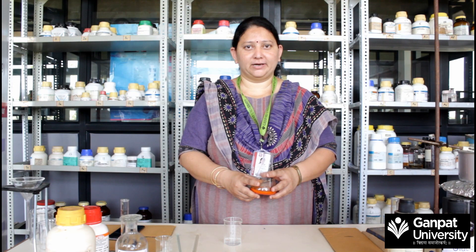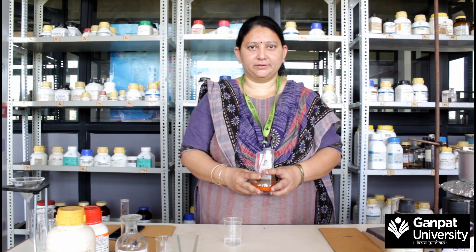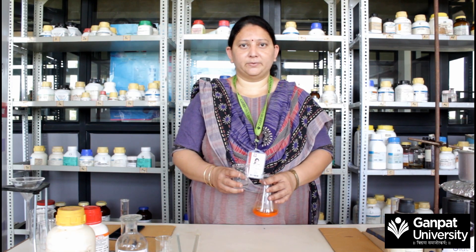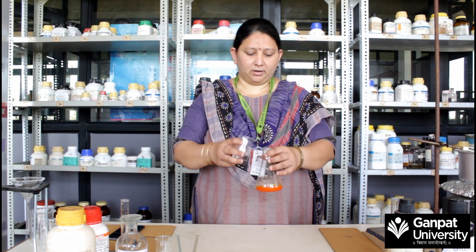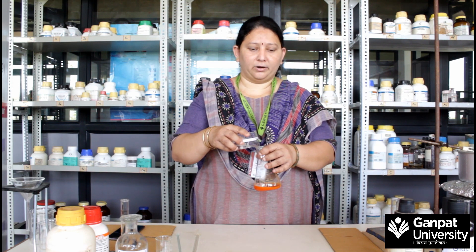After that addition, N,N-dimethylaniline and the diazonium salt are coupled. Now add 20% sodium acetate solution — about 35 ml — to obtain the sodium salt of methyl orange dye.